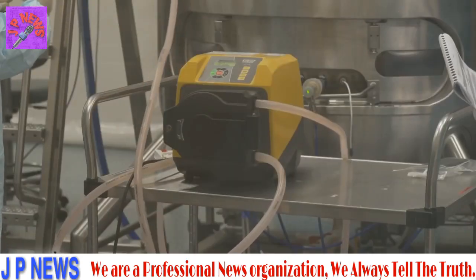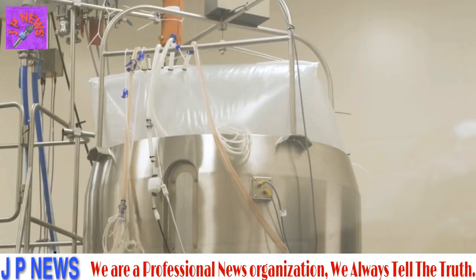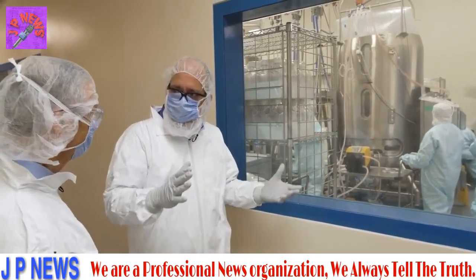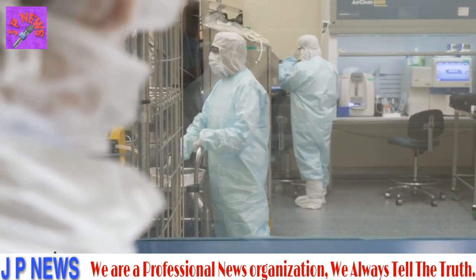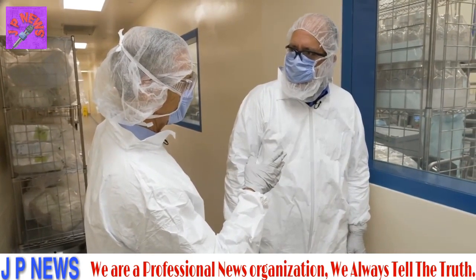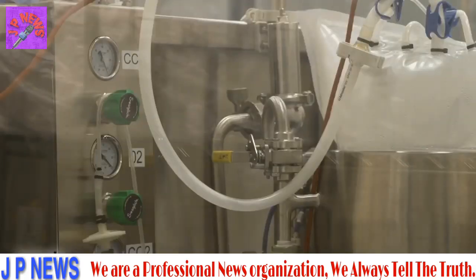So what is going in and out through those tubes? That large-scale bioreactor before you has within it a rich broth that is used to grow the biological foundation of this manufacturing process. For those of us who never got past biology in junior year of high school, you're basically making a soup in there. It is a very well-controlled, highly defined soup. And into that soup, you're going to introduce the virus. That's right.